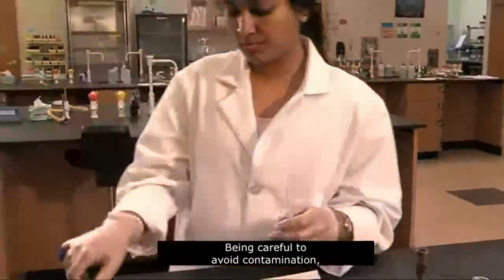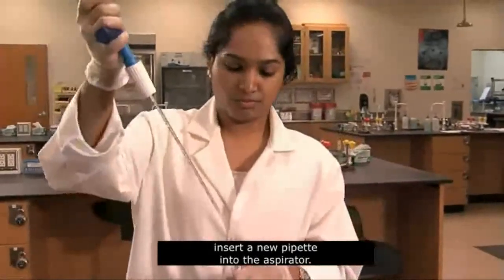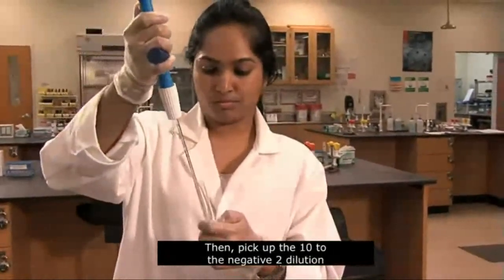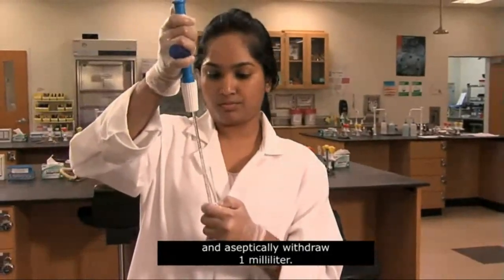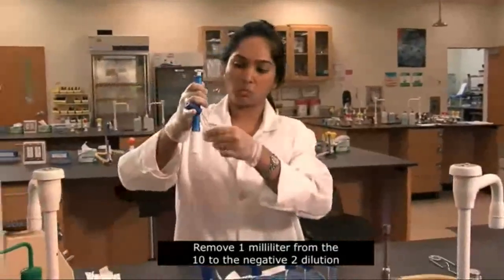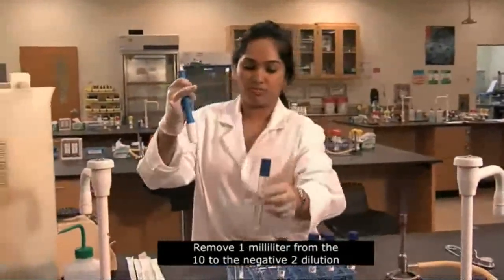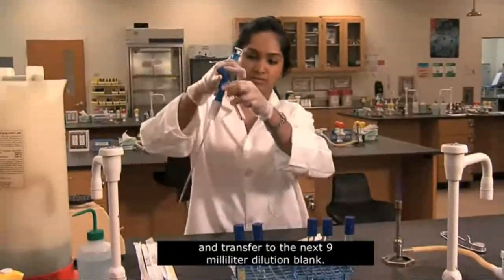Being careful to avoid contamination, insert a new pipette into the aspirator. Then, pick up the 10 to the negative 2 dilution and aseptically withdraw 1 milliliter. Remove 1 milliliter from the 10 to the negative 2 dilution and transfer to the next 9 milliliter dilution blank.